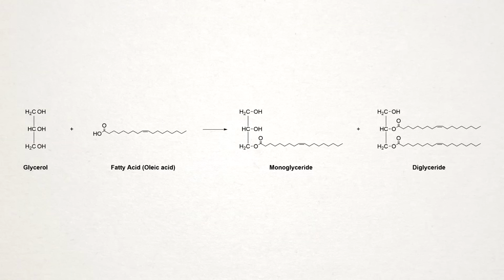Anyway, all of this isn't to say that this reaction can't be done. The esterification of glycerol and fatty acids is actually done frequently in industry. However, they usually make mono or diglycerides because they have some unique properties. If I was really dedicated to get my triglyceride project going, I would have to tinker with a lot of reaction conditions, and I don't really think it's worth it.